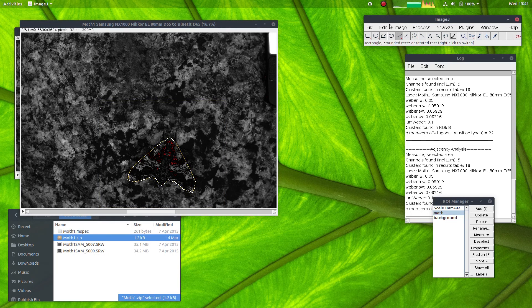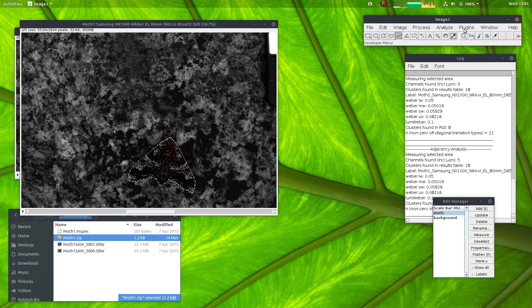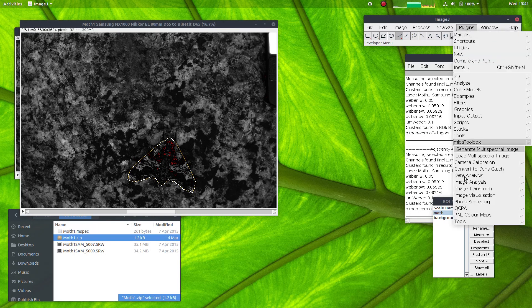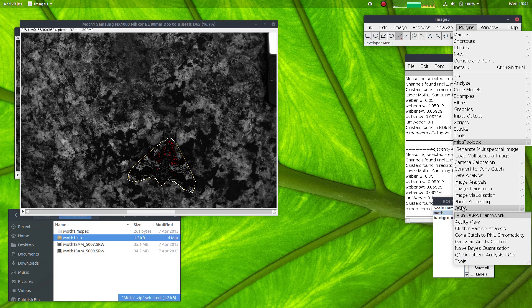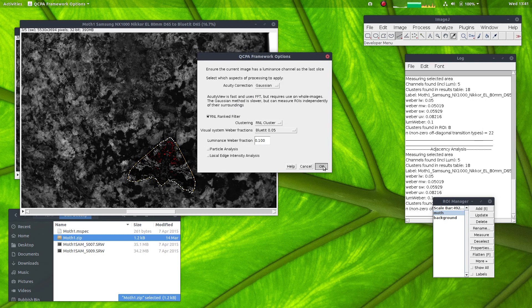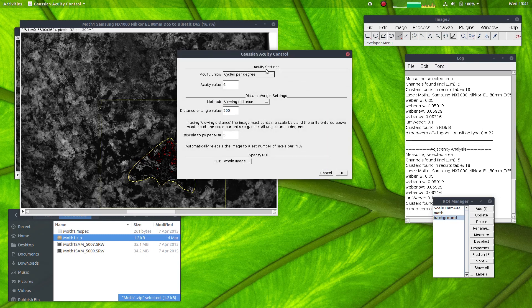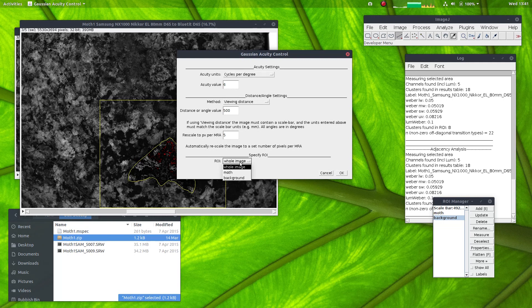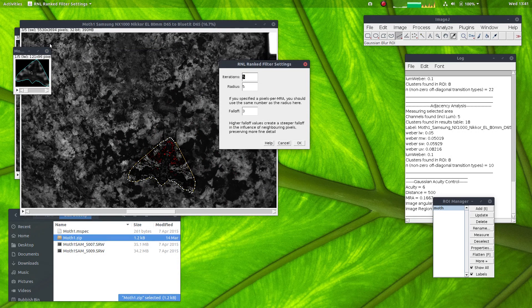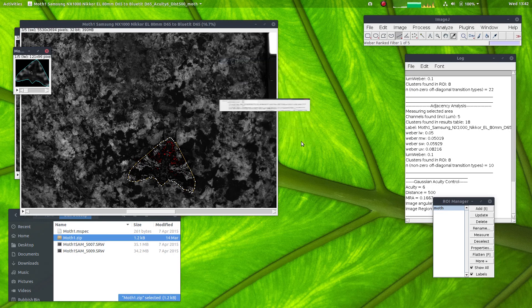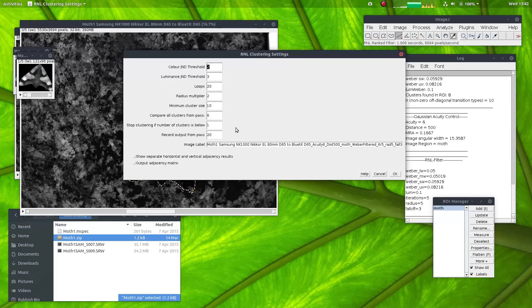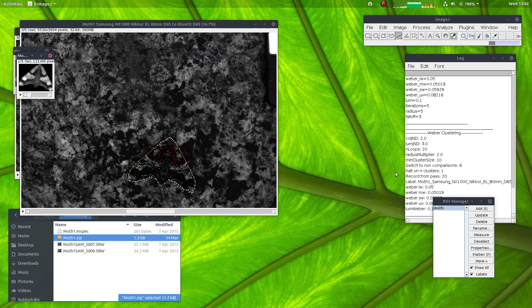Now I'll demonstrate how to run the QCPA framework with background independence. So I'll again go QCPA, run QCPA framework and use all of the same settings here. But in this next dialog box with the Gaussian acuity control, I will here choose to do the moth on its own. You can see this has selected the moth and it's only processing this for the subsequent image processing. And again I'll choose the same clustering settings.